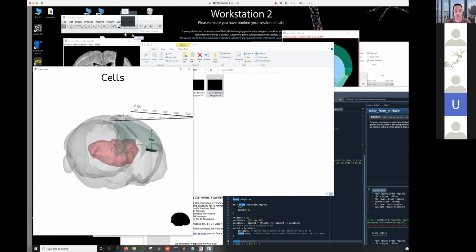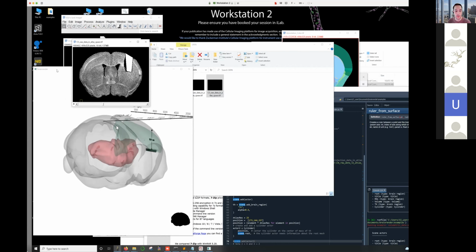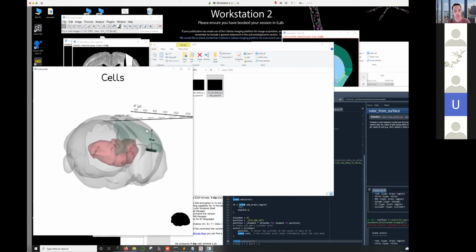I can very quickly show you. This is where I annotated the grin lens. I've made a really bright region here. And if I look at that in 3D, it's going to be a little bit ugly. It's voxelated and blocky. This way you'll have a nice smooth rendering of the lens, and much nicer renderings of the annotations. And one thing that's really difficult to do quickly in something like Imaris is creating all the surfaces for all these brain regions and then adding in the cells. You can end up spending hours on there.